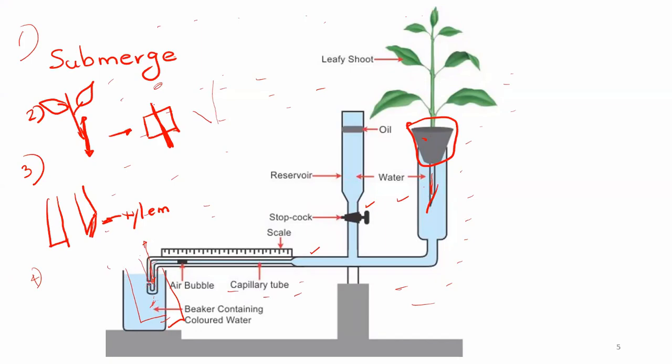Yes. Then after we can make this setup according to our needs on the table or any benches. Afterward, now we have the air bubble in here. Okay. So afterward, we can place this setup into the sunlight. Okay, to allow the transpiration.